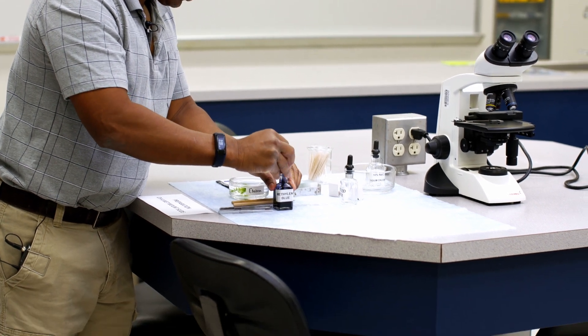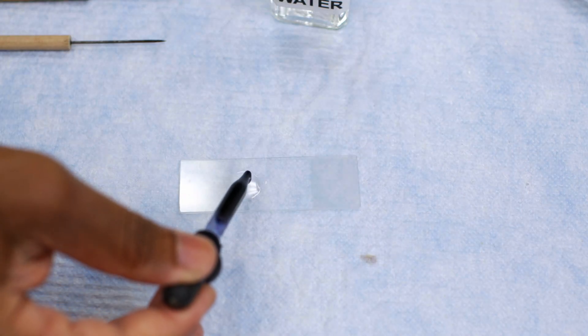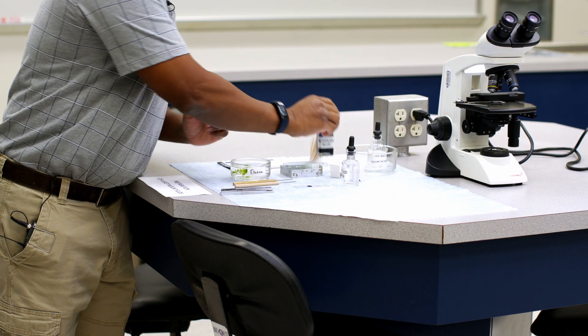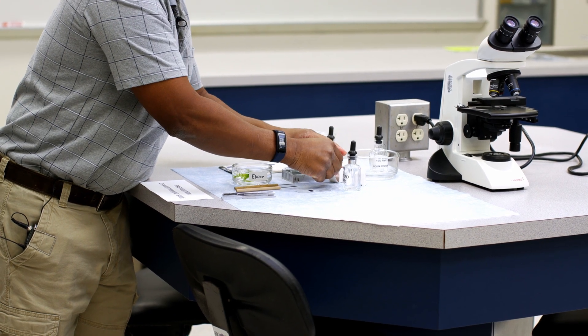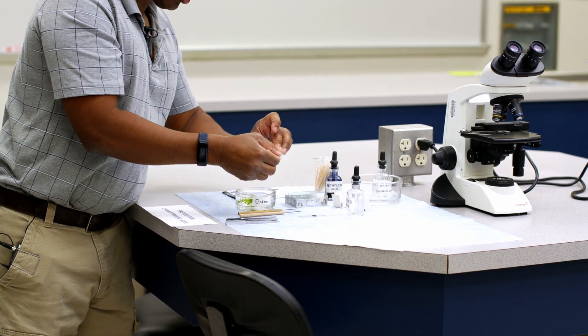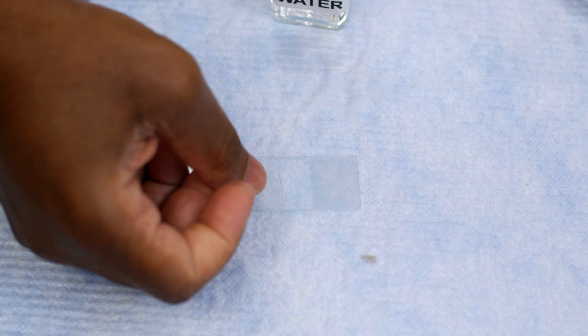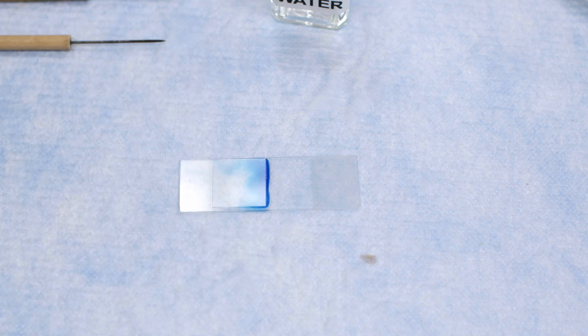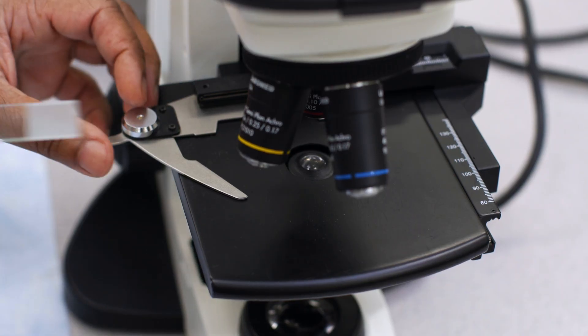All we need to do is put one drop of methylene blue on our sample. Then, as previously, we want to apply the same technique to remove any air bubbles — angle the cover slip until it hits the water, and then slowly let it drop. Now we're ready to actually view our cheek cells under the microscope.